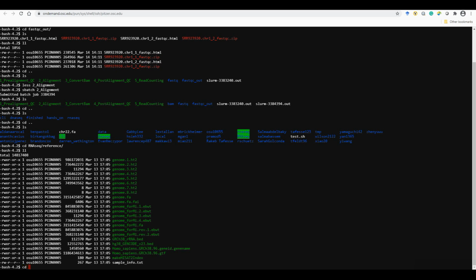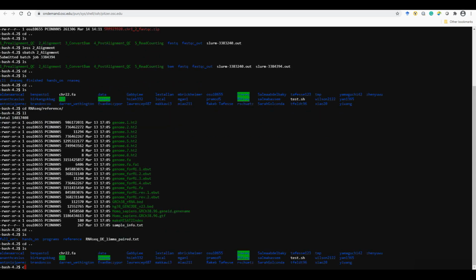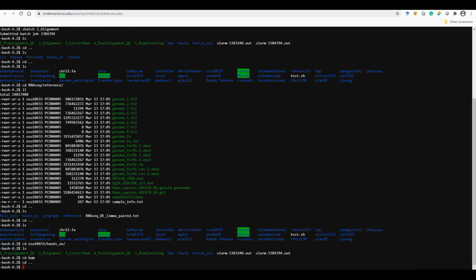Now let's look at the alignment results. So the BAM file is already out. We can first look at the slurm out file.